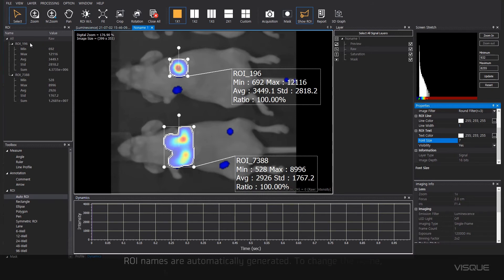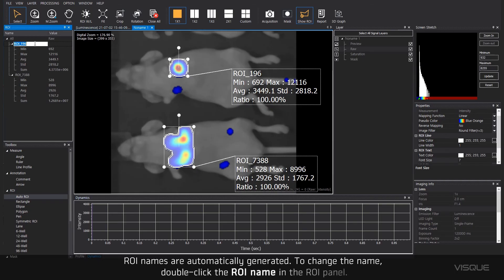ROI names are automatically generated. To change a name, double-click the ROI name in the ROI panel.